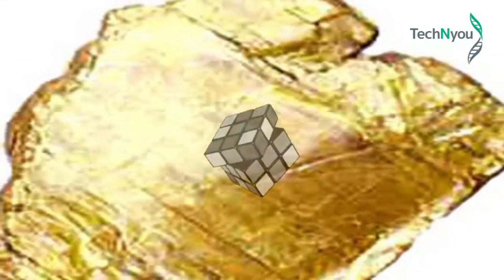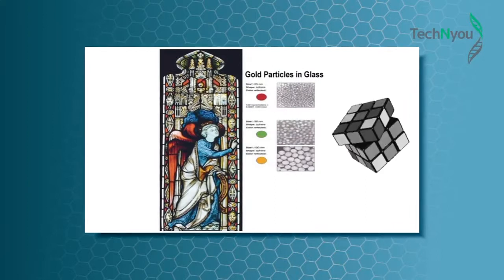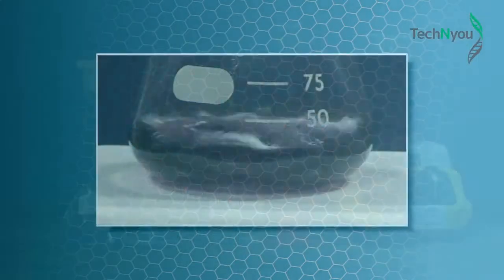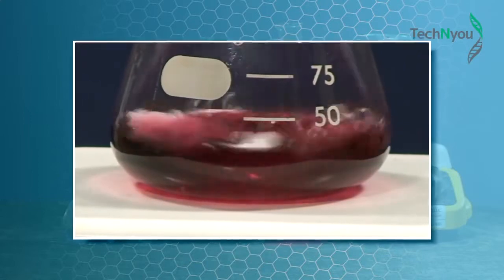Nanoparticles often exhibit different characteristics from the bulk form of the element because of their size and greater surface area to volume ratio. Colour changes at the nanoscale directly relate to the size of the nanoparticle, a characteristic that is particularly evident in the synthesis of gold nanoparticles.